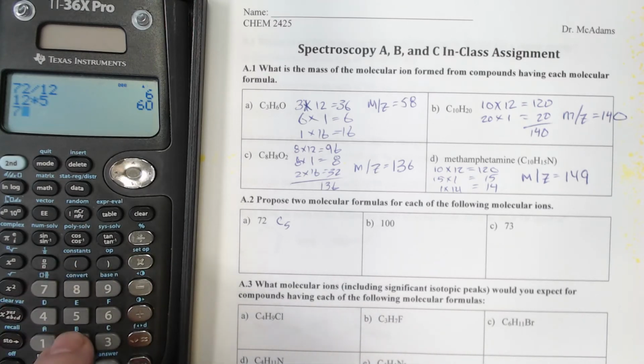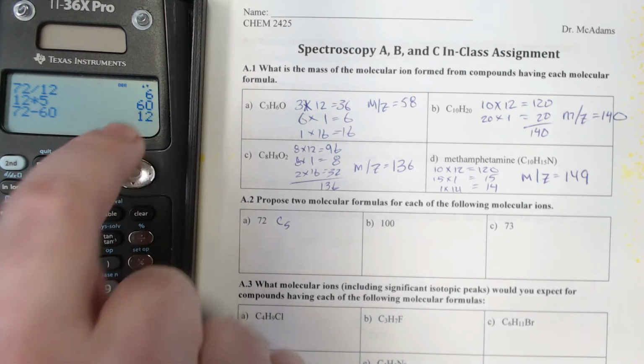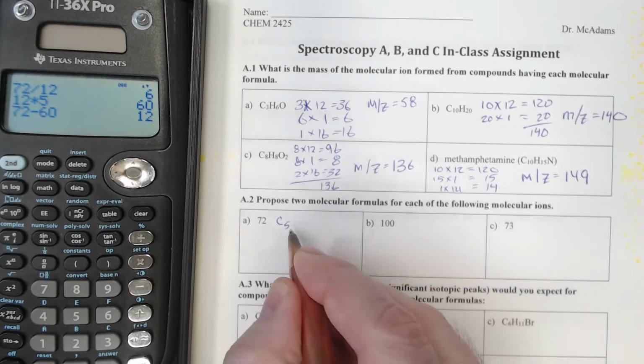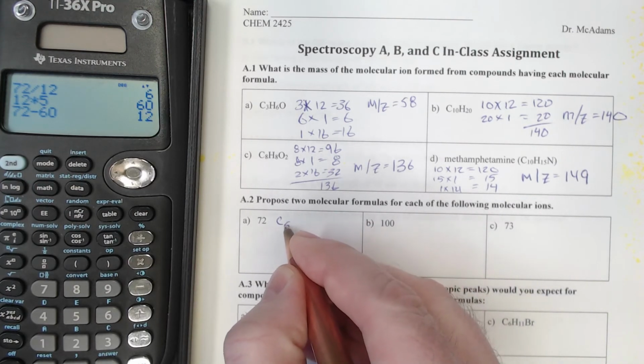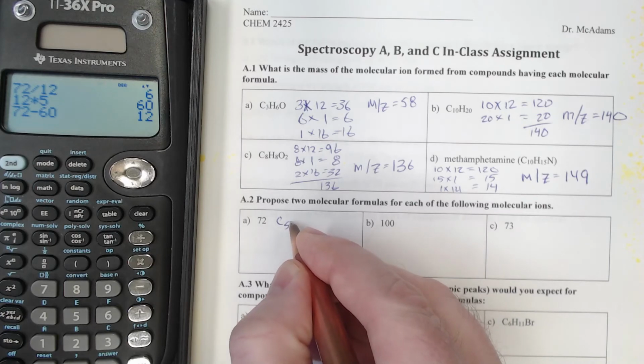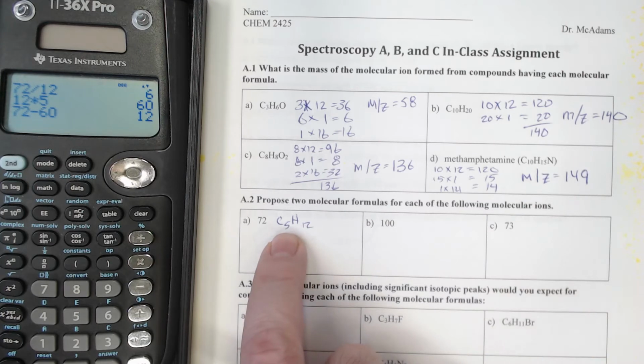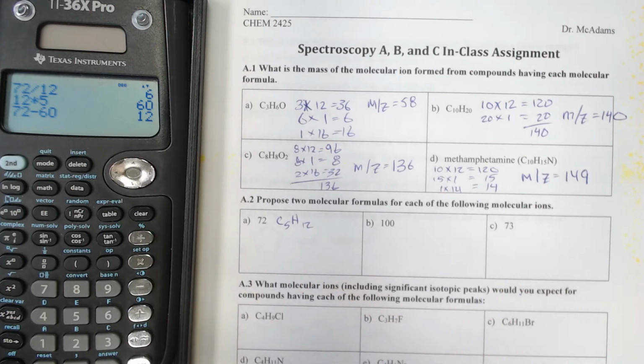Let's subtract that 60 from 72, and that gives us 12 hydrogens. That makes sense. When you have a pentane that's fully saturated, it would have 12 hydrogens. So that formula for pentane would have a mass of 72.